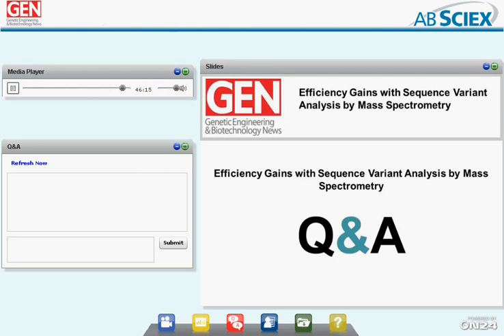I was just going to say that one of the interesting features of that partial de novo style searching that Jason was talking about is that it's equally useful for post-translational modifications as well. You search for as many as 350 PTMs while searching for sequence variants at the same time, and it will have the same benefits of lower false positives and higher true positives.